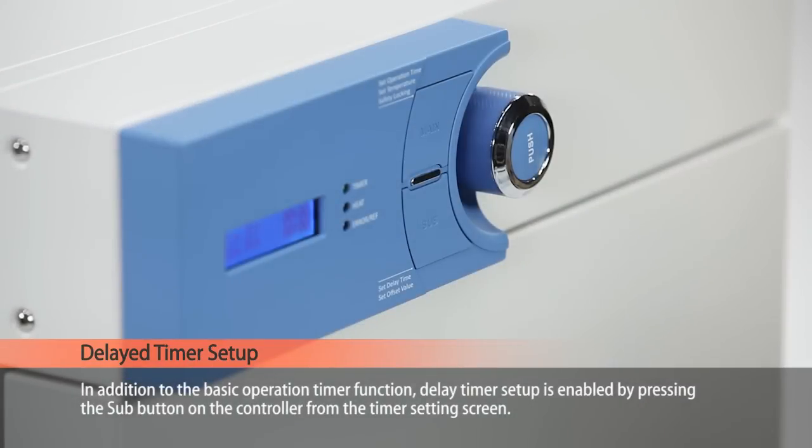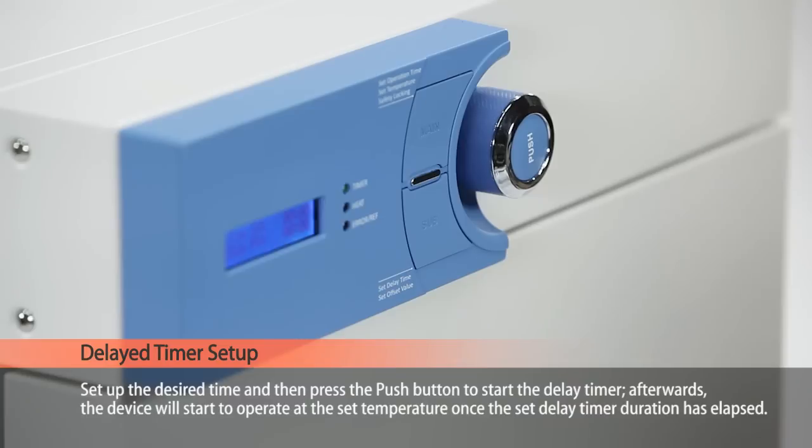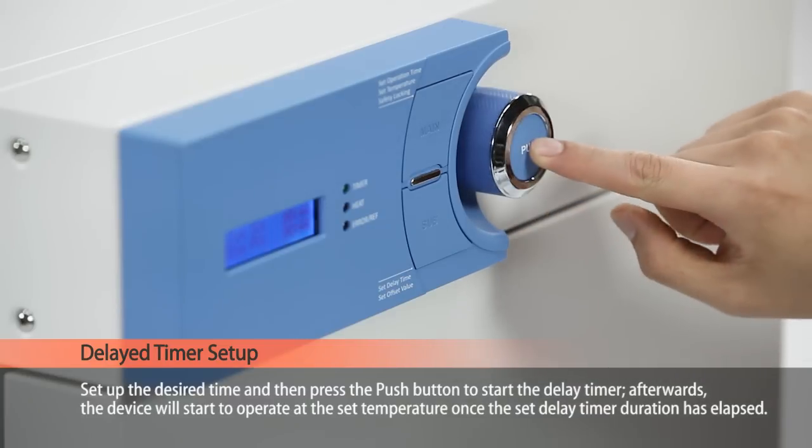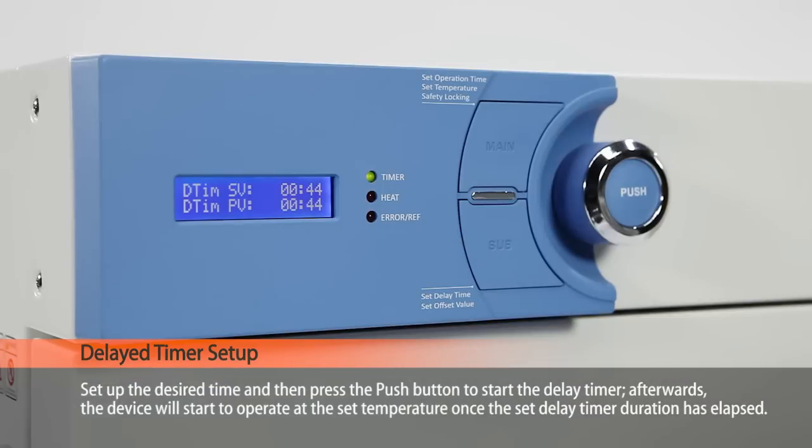In addition to the basic operation timer function, delay timer setup is enabled by pressing the sub button on the controller from the timer setting screen. Set up the desired time and then press the push button to start the delay timer. Afterwards, the device will start to operate at the set temperature once the set delay timer duration has elapsed.